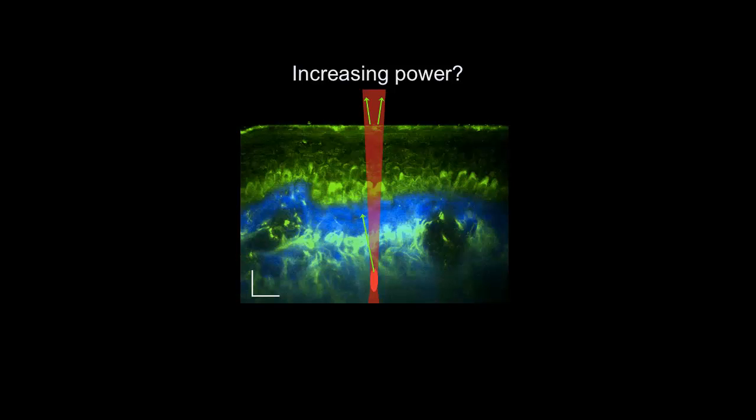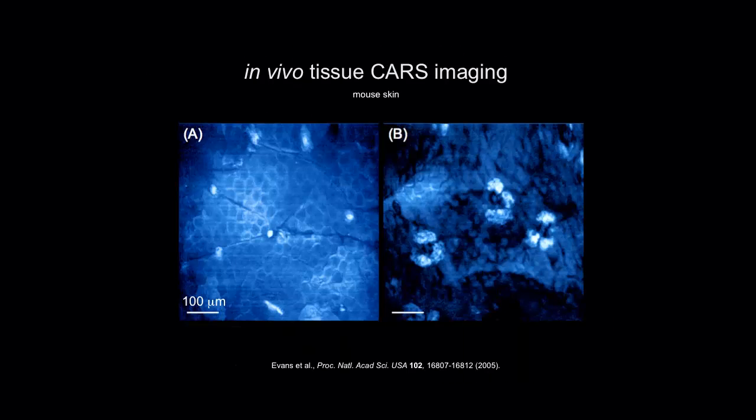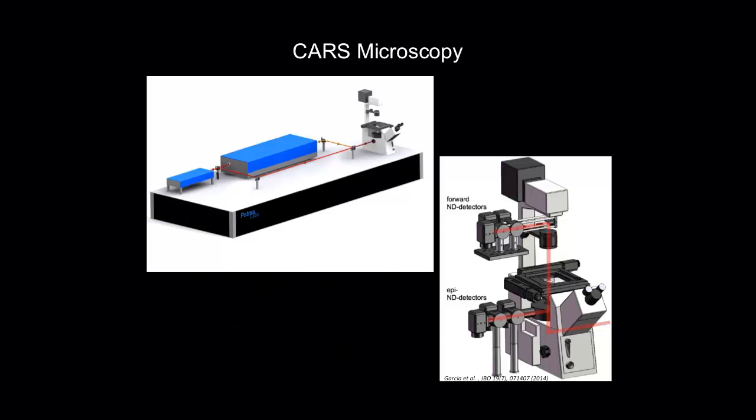I'm sorry, I won't have time to go over the Raman, but I had a typical layout of a microscope for the coherent anti-Stokes Raman spectroscopy. But this is how we use the detection system in our microscope.